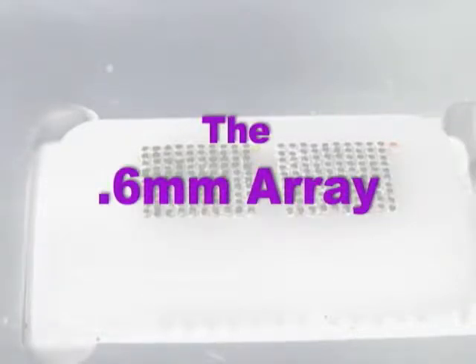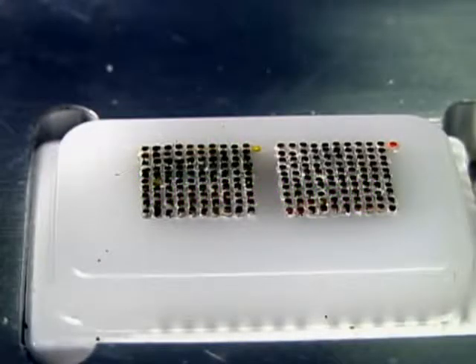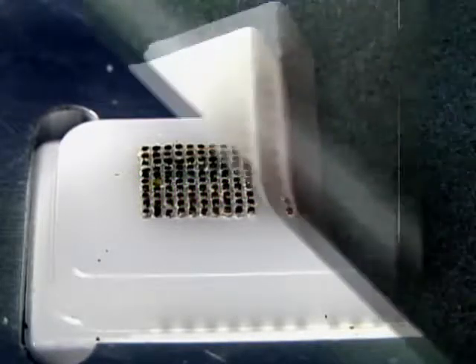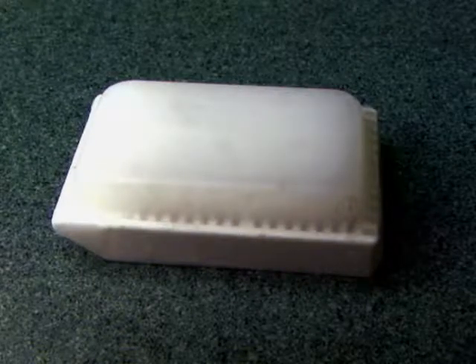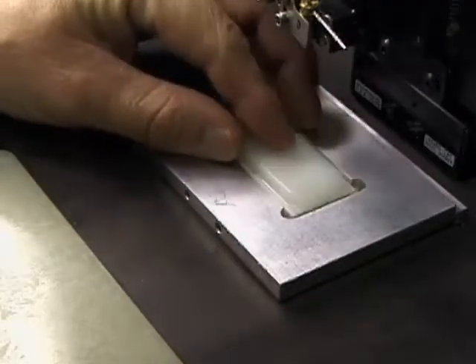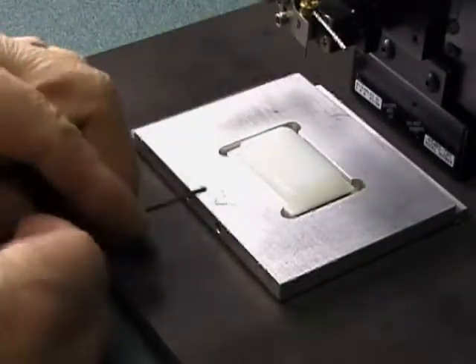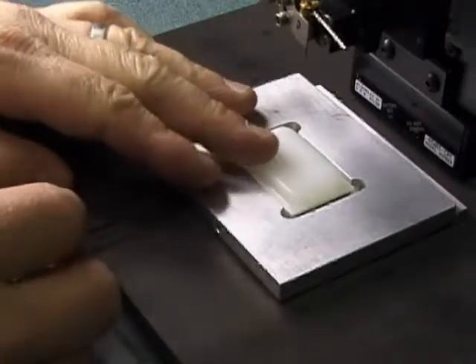The array or recipient block begins with a blank paraffin block. Use embedding type paraffin only, not infiltrating paraffin. The chemical makeup of embedding paraffin is harder and makes for easy sectioning. Place the array block into the array block holder. This receptacle has two screws that are used to tighten the array block down while punching.